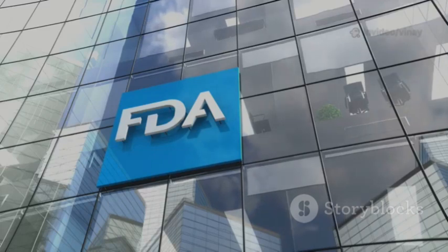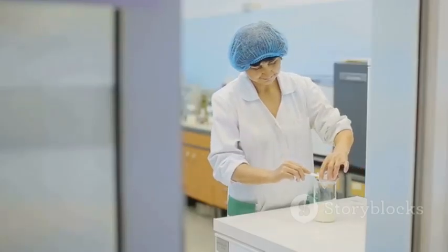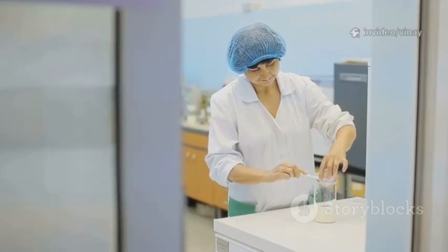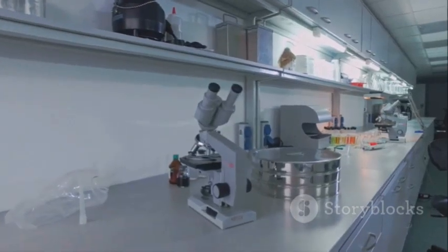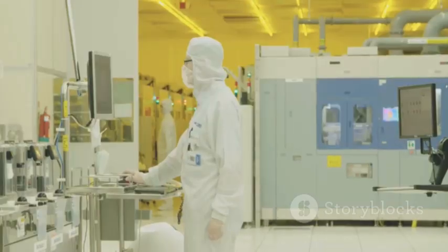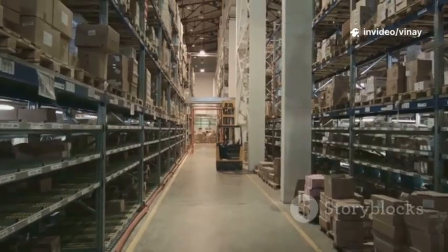The rules and regulations set forth by global health authorities like the US Food and Drug Administration, the European Medicines Agency, and the World Health Organization underscore the global consensus on this matter. These agencies mandate that sterile products produced by filtration must be checked with an integrity test. They require manufacturers to validate their testing methods and to document every test result. This regulatory framework ensures that every company, no matter where they are in the world, adheres to the same high standards of safety, creating a reliable global supply of safe medicines.